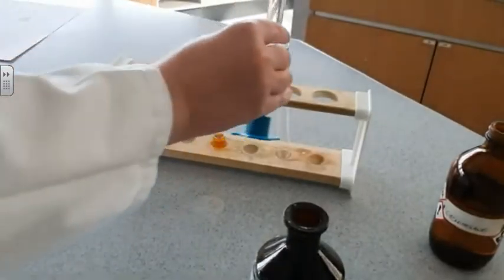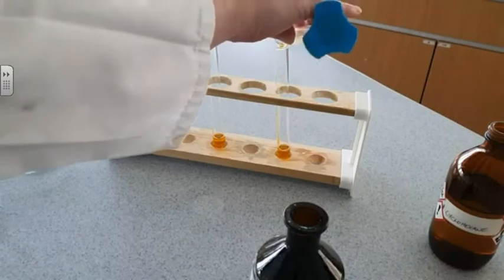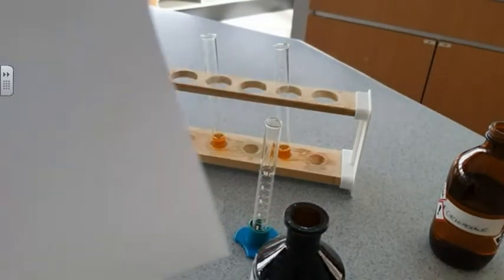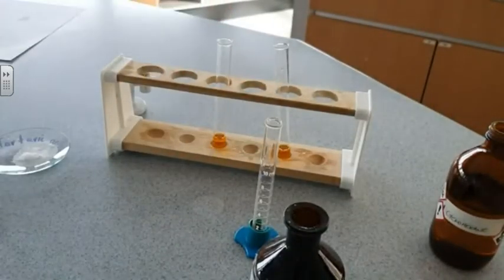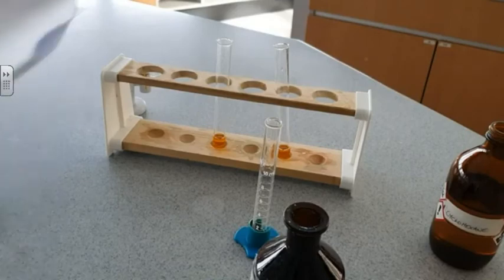So it's a powerful oxidizing agent. When it reacts with a primary or secondary alcohol, they will be oxidized. It will also oxidize an aldehyde. And as it does its reaction, it is reduced to chromium 3. Chromium 3 is green in colour, and so the colour will change.